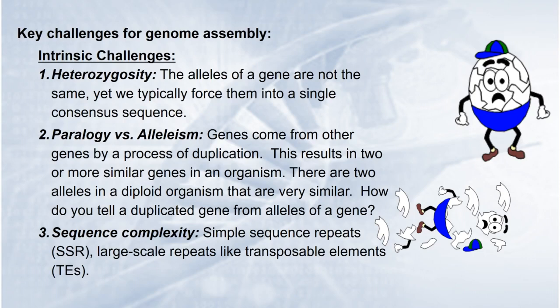The most obvious ones that you'll come across are the ribosomal RNA copies. There are multiple copies of near identical ribosomal RNA genes in most bacteria, and so they are probably the single most problematic aspect of these genomes.